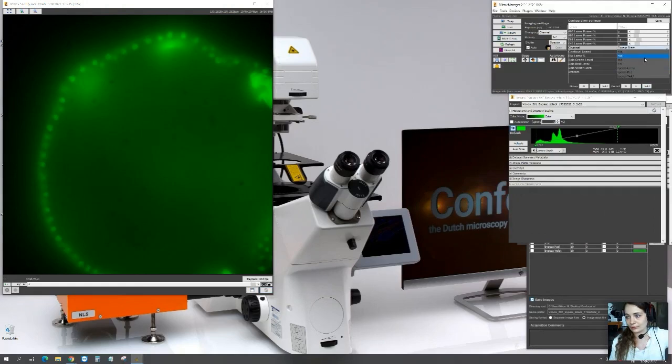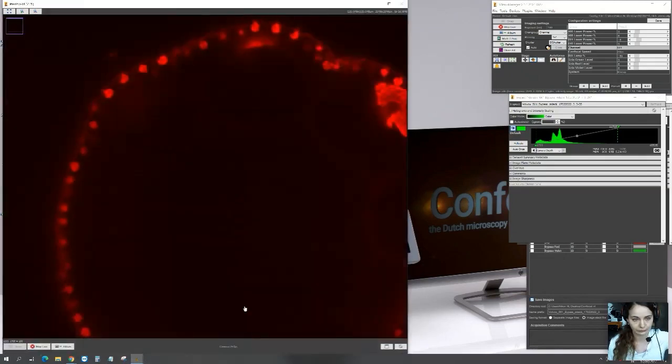So let's go to NL5, because that's what we want to see today. It's just an easy click and then we can already go live. Of course, it's better to choose the same color for that.